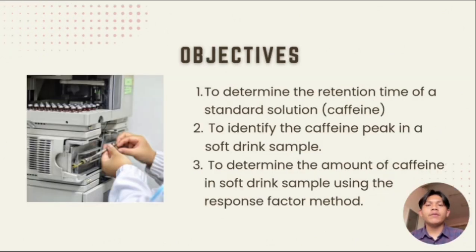So the objective of this experiment is to determine the retention times of standard solution, which are caffeine. Next, to identify the caffeine peak in a soft drink sample. And lastly is to determine the amount of caffeine in soft drink sample using the response factor method.